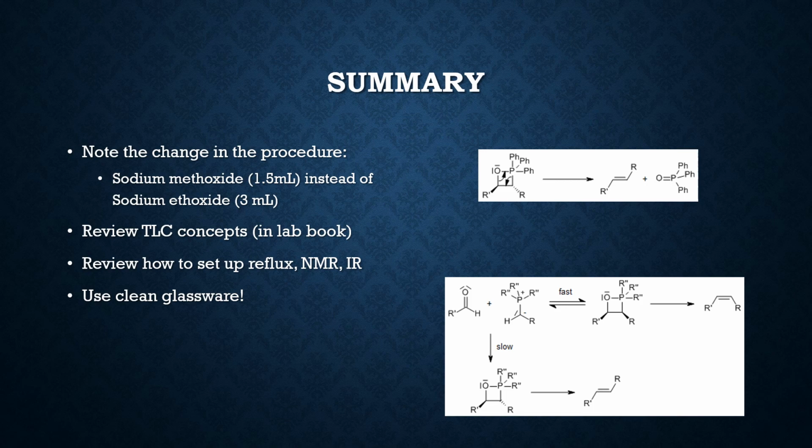So in summary, take a note of the change in the procedure between sodium methoxide and sodium ethoxide. Review your TLC concepts, the thin layer chromatography, both in this video and what's written in your procedures in your lab book. Don't forget how to set up a reflux, and your NMR and IR. I know at this point in the semester you guys have been doing this a lot, so hopefully you remember how to make the proper samples. Use clean glassware. It's going to be very important when you're running this reaction. Make sure everything's nice and clean. So make note of these changes, review your stuff, and you will be all set to go into lab.